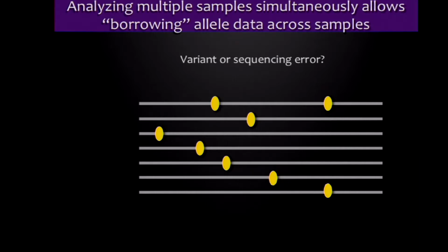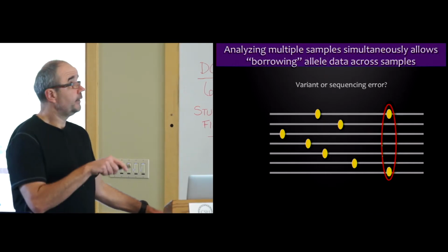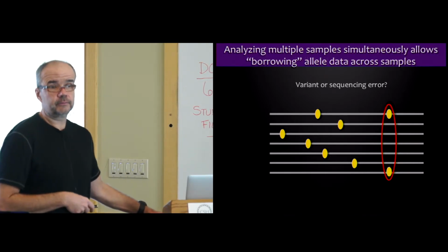In populations, if I look at these individual variants in this individual, that individual, and I see them only once, I will be less likely to believe it than if a variant recurs in more than one individual, right? So of these, this variant is the one I tend to believe most, because I see it in more than one case.